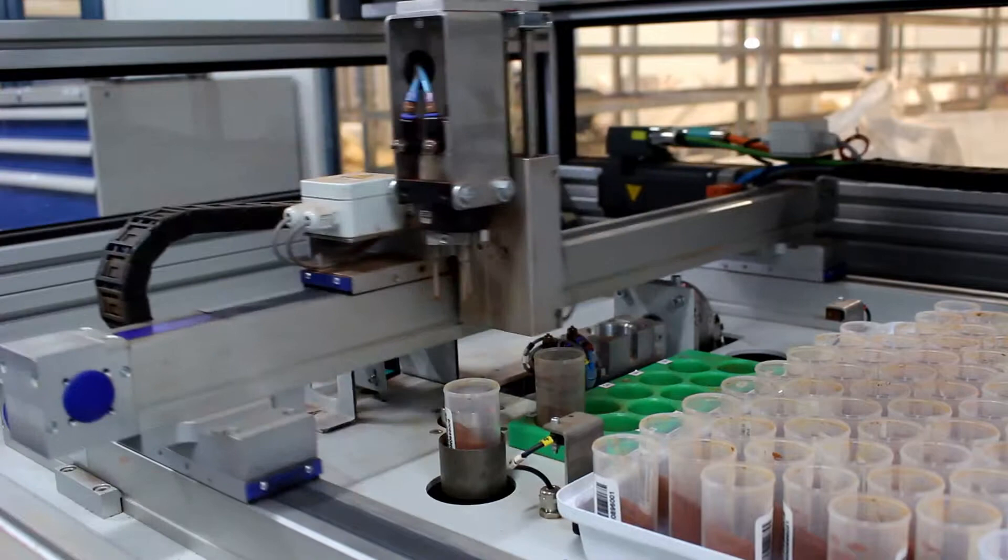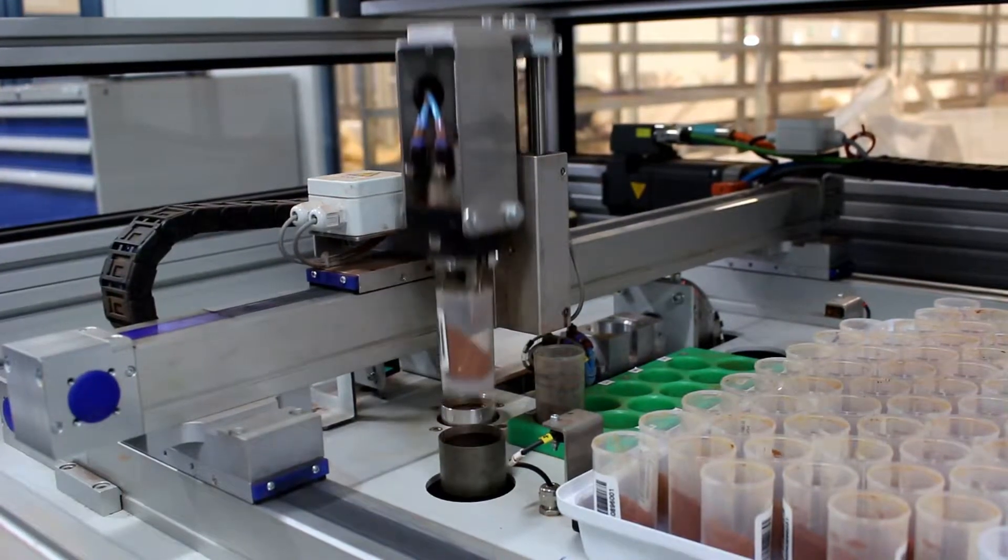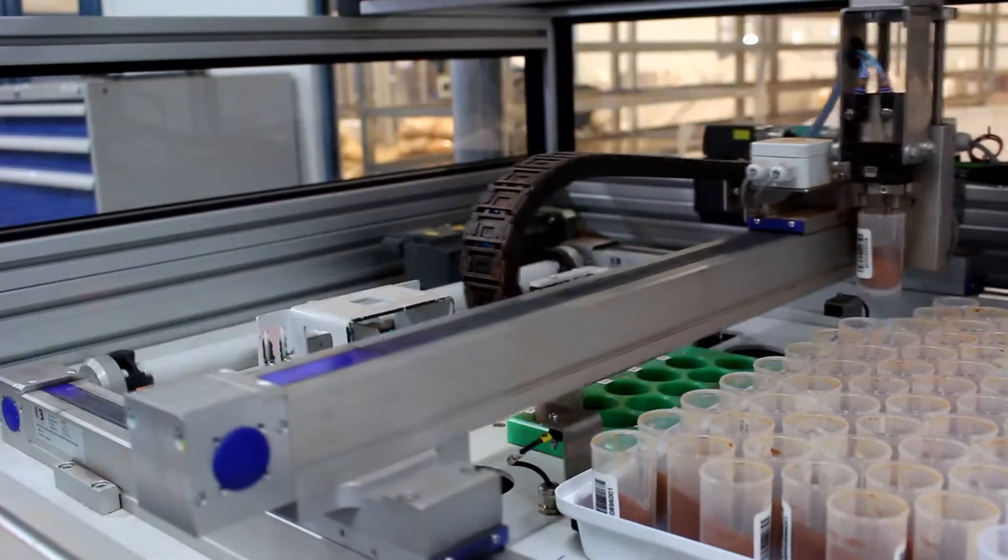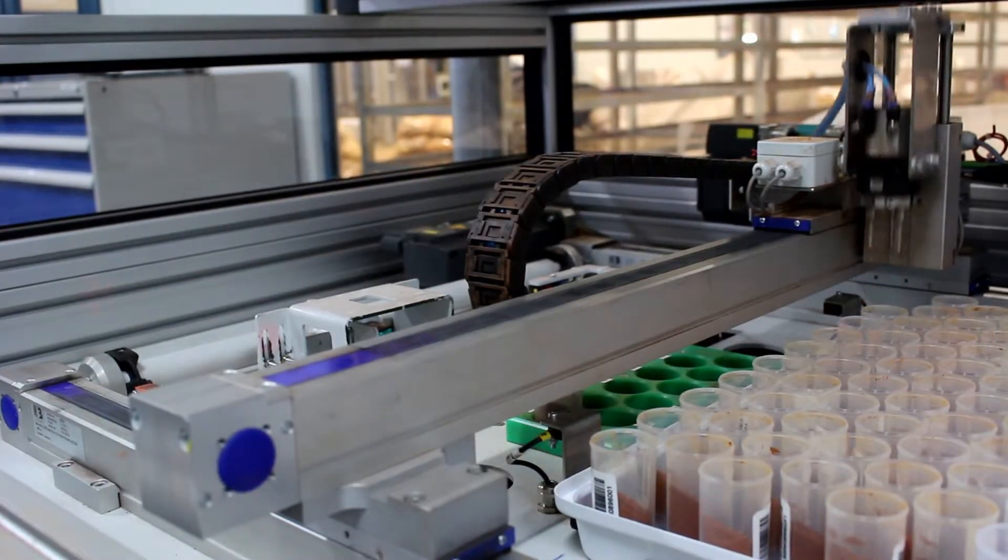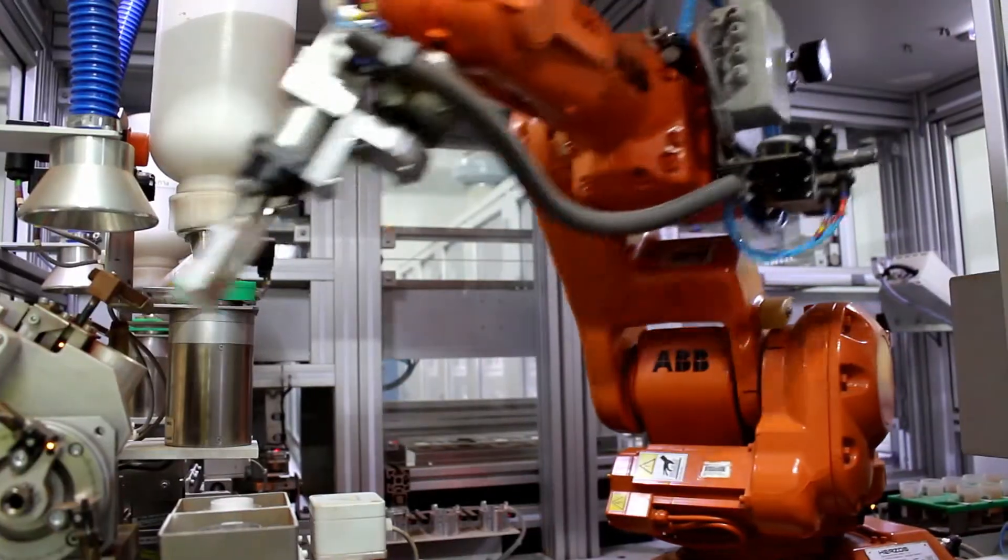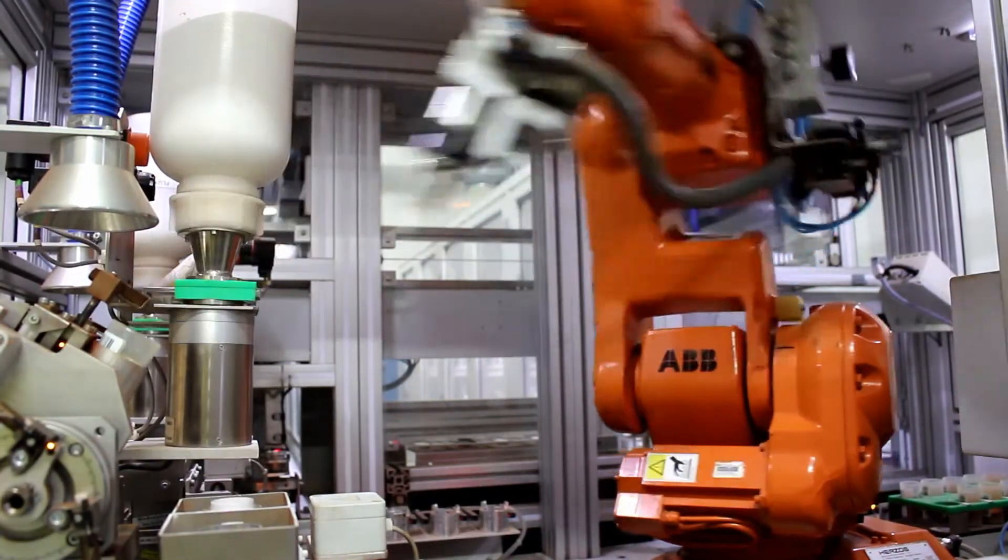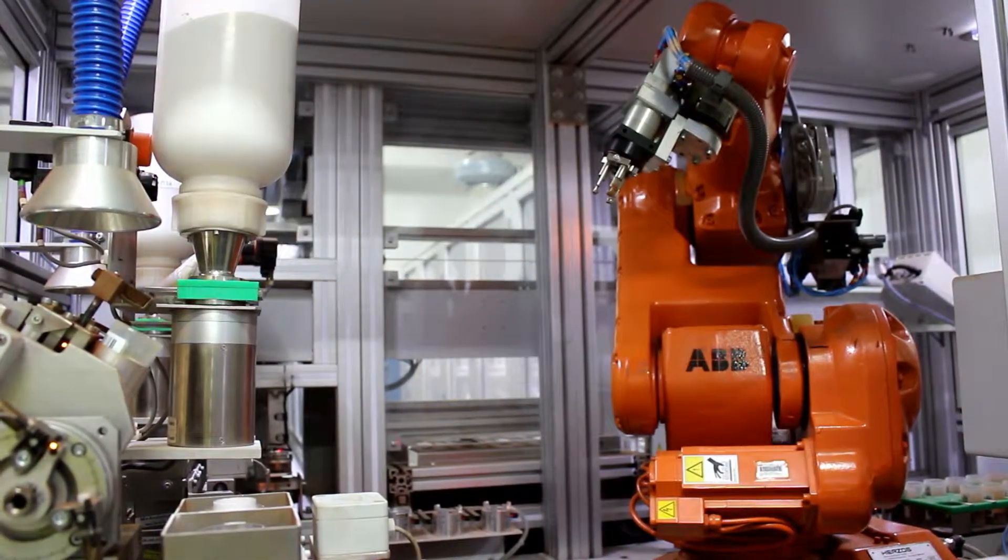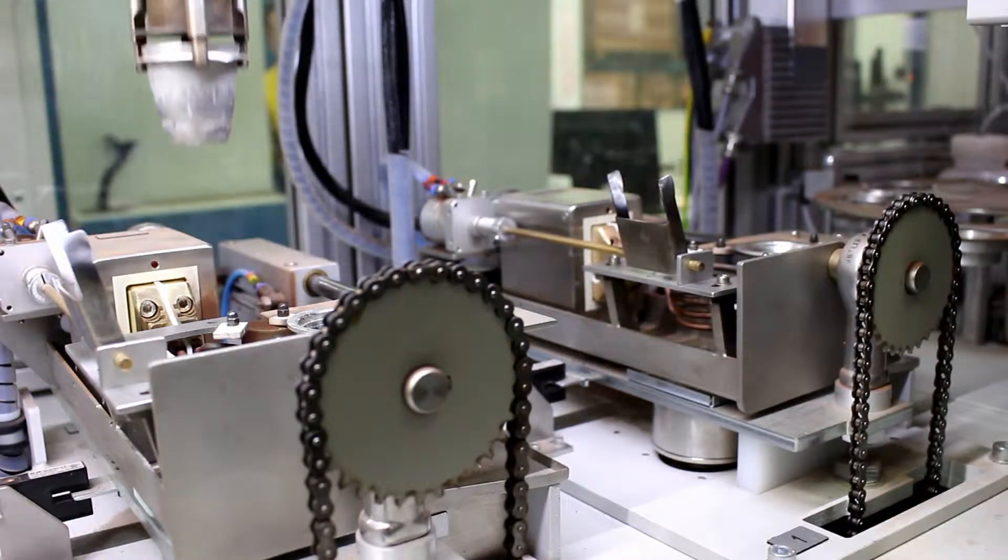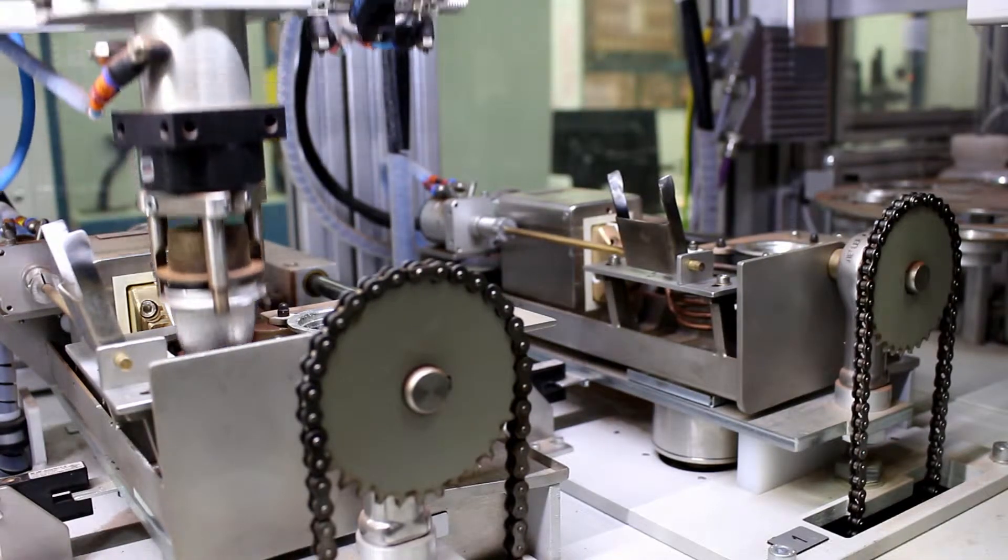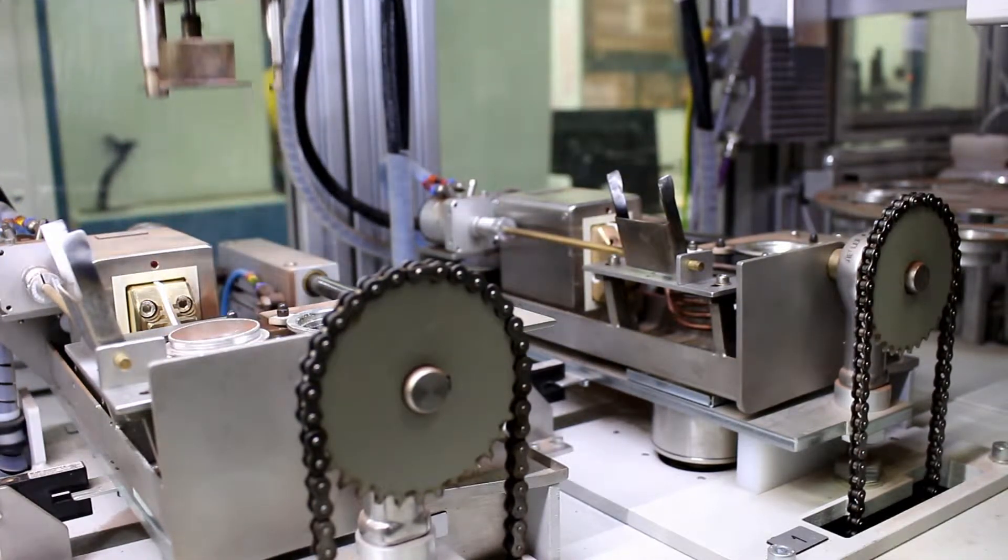The main advantages of automated laboratories are that they significantly reduce the safety risks associated with manual systems and offer much greater precision and accuracy with no risk of sample mix-ups. Additionally, fewer personnel are required and a much higher sample throughput rate is possible.